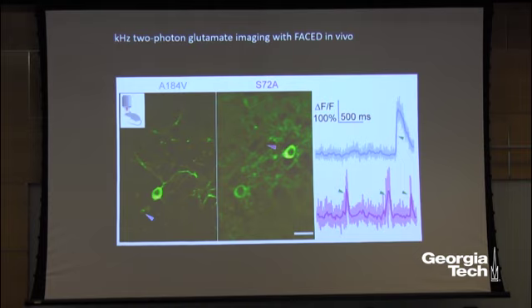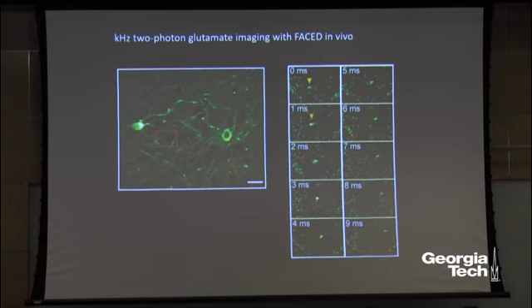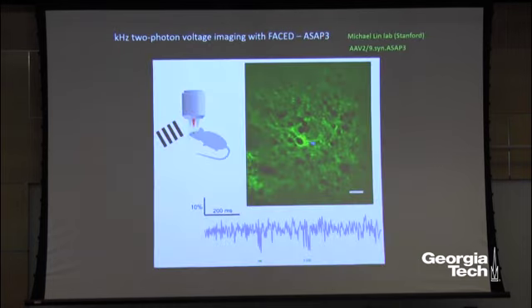And we're looking in vivo as well. Here we're just looking at spontaneous glutamate release. And in those processes, again, we see those responses very easily. Interestingly, when we were doing one experiment, we noticed at 1,000 frames per second that in this small region, there's a bright structure very rapidly flying by through the field of view at a speed of 1 millimeter per second. The only reason we were able to see it is because we're imaging very fast. We think it's probably a microglia cell that gobbled up the fluorescent molecule and is just flying by in a blood vessel.